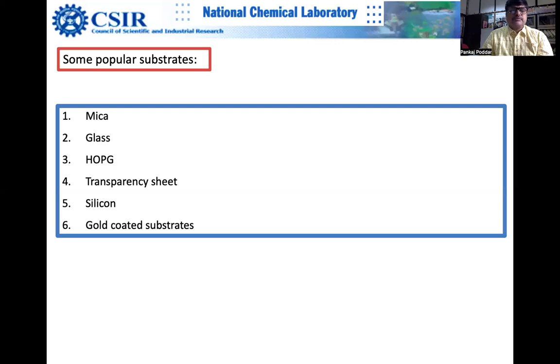The problem is with the functionality. Silicon always has a top layer of silicon oxide. You can etch it away, but it easily gets coated in ambient conditions with an ultra thin layer of silicon oxide. So again, its surface roughness is somewhere around 2-3 nanometers most of the time.